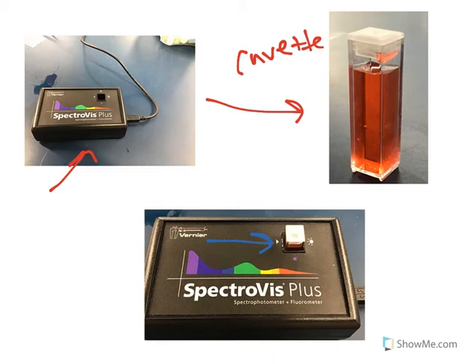If you were to put this ridged side in, those ridges might absorb some of that light, giving you an incorrect absorbance. Also, when you handle this cuvette, it's important that you only touch these sides with the ridges, as those are the sides that are not being measured. If you were to touch the smooth side, the oils in your finger might deposit onto the smooth side, which will cause more light to be absorbed, and you'll get a false reading.